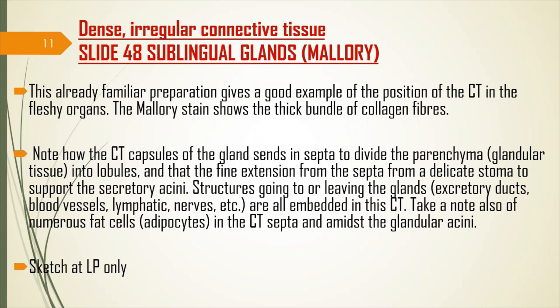Next is dense irregular connective tissue found in the sublingual glands — a familiar preparation from when we studied exocrine glands. It gives a good example of the position of connective tissue in fleshy organs. The slide shows thick bundles of collagen fibers. You only need to sketch this at low power, showing how the collagen fibers separate the parenchyma into lobules.